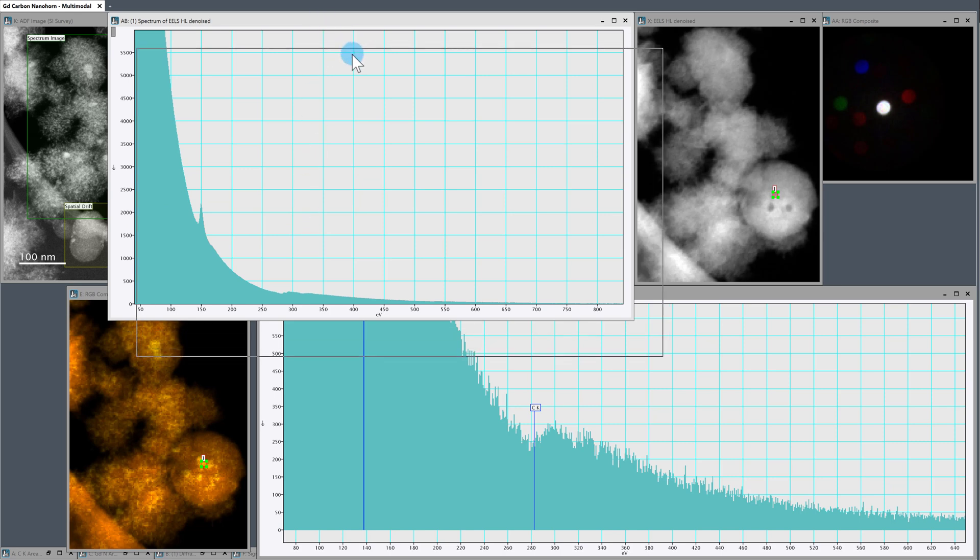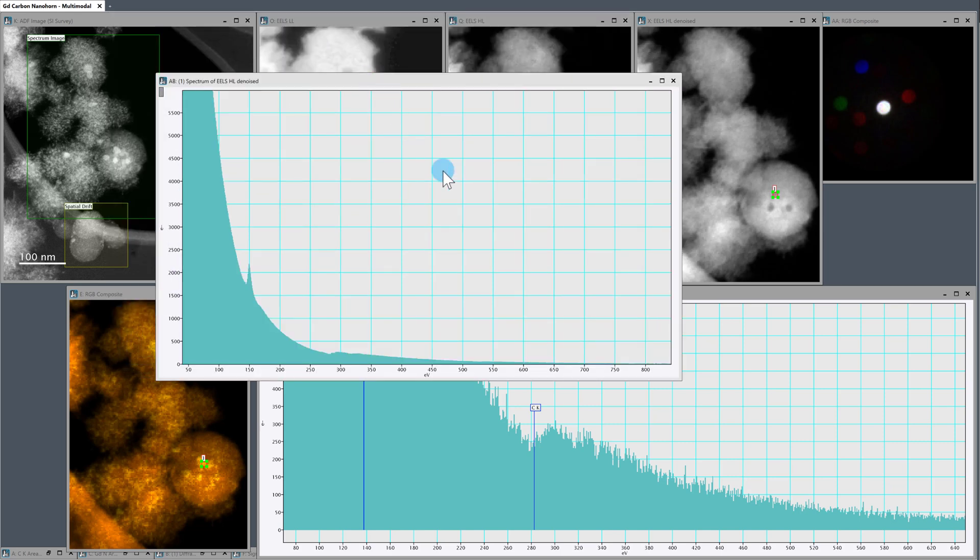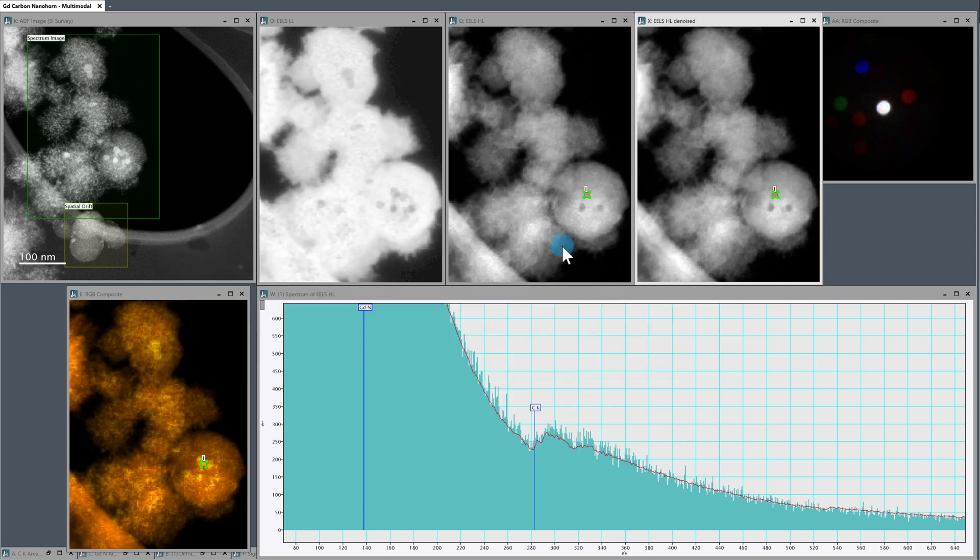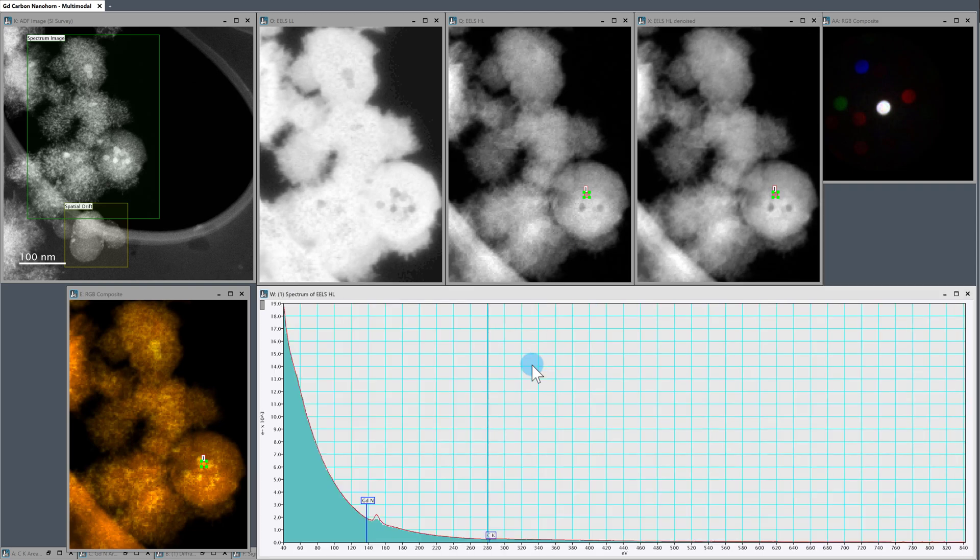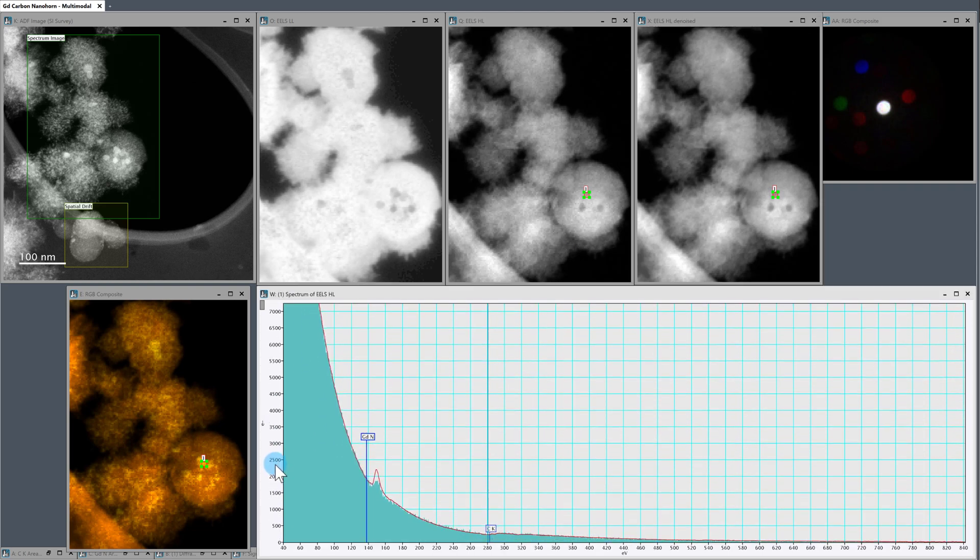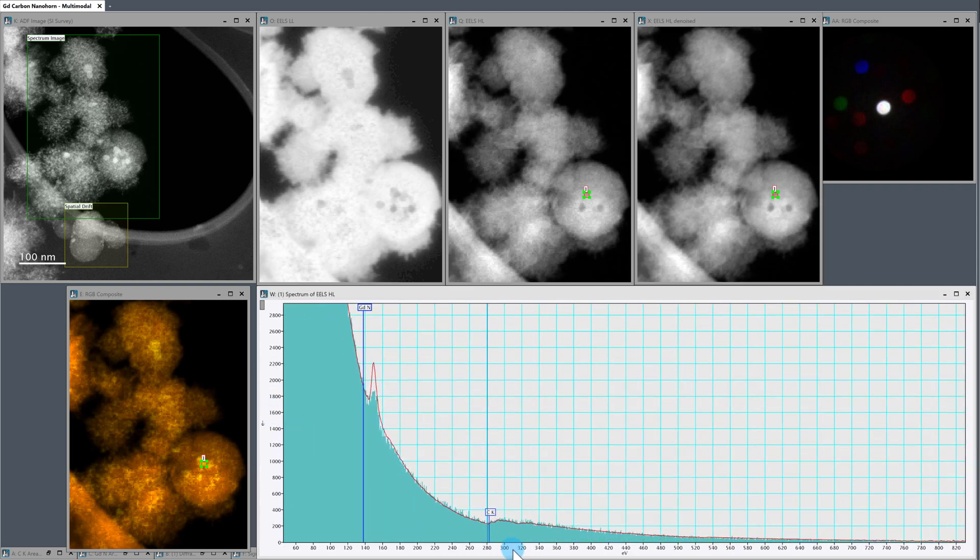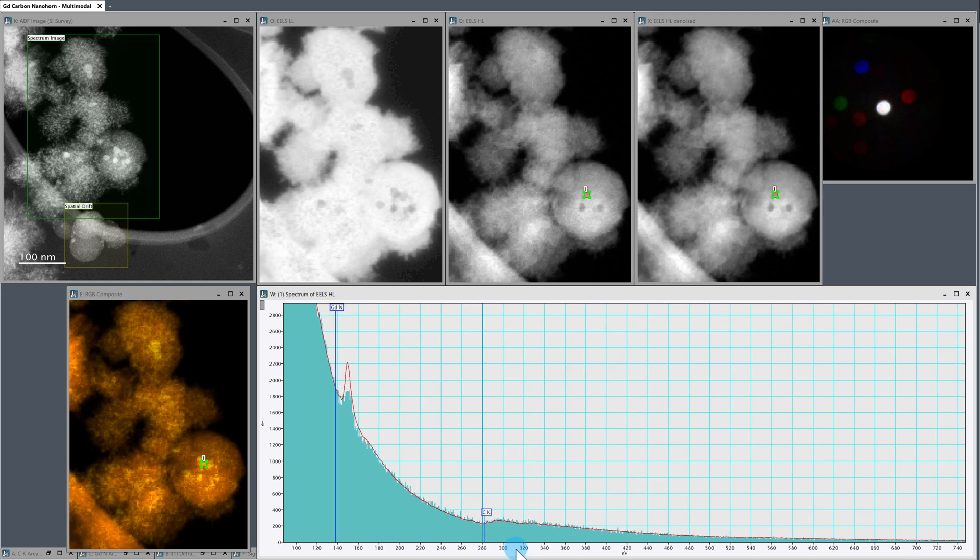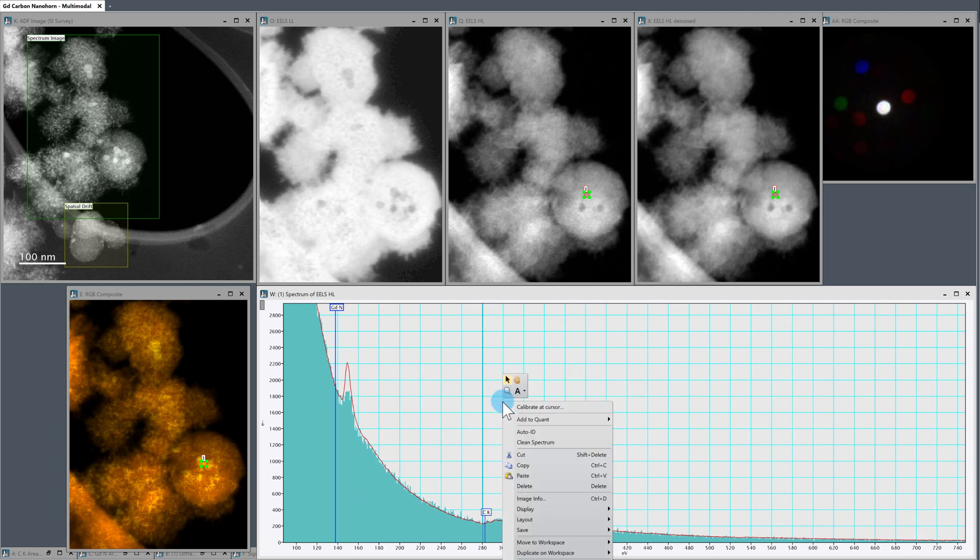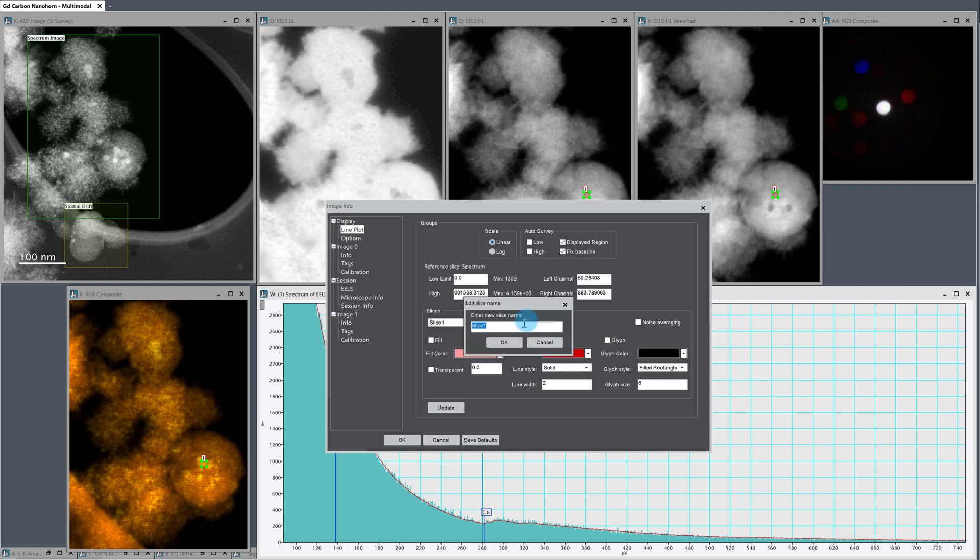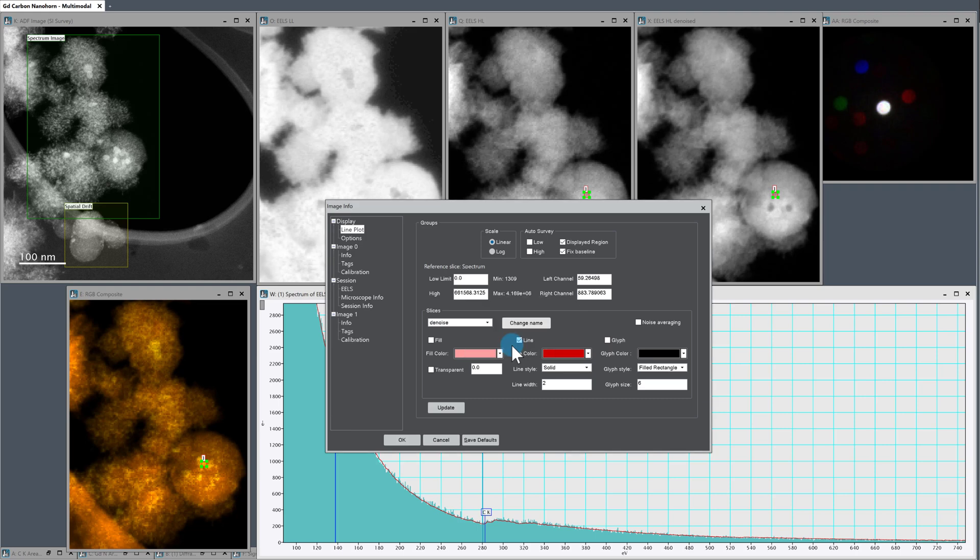Now, a really nice way to display these is actually to, if you right click now, we have this option to overlay the picker data. So we can overlay the picker data. And this is a nice way of having our raw EELS data and our denoised data together in the same plot. So the way I like to visualize that, I like to have the denoised data kind of solid.